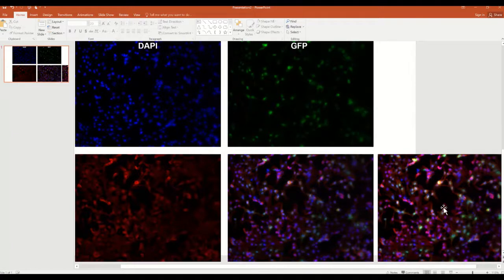Okay, again, it's important that you understand that when you apply such new exposure parameters to your sample, when you modify this brightness and contrast, it's important to apply it to all of the images in this series. You can treat each channel separately, but all of the images have to be treated in the same way. So right away you can see this difference. Much easier to see what's happening here than here.